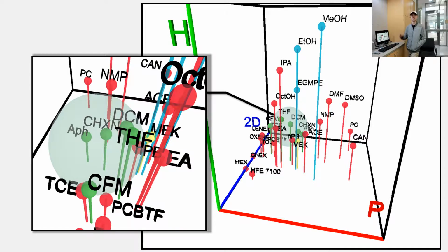It wasn't able to clean off the industrial Sharpie, but it is one of those solvents that just couldn't fit in either of the spheres. Yeah. And you can see in propyl bromide, it's right there blocking MEK from being in the sphere. Yeah, so we have propyl bromide and TCE, and we have that.